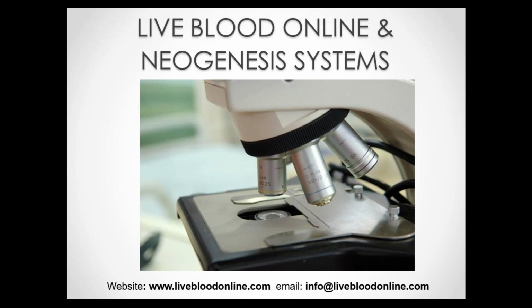Whereas in live blood analysis, because the blood is collected from the finger and placed immediately on a slide and viewed straight away under the microscope, under high magnification, and of course nothing is added to the blood, it is viewed exactly like it is in the body. So any anomalies that are seen are there because that is the condition of the blood and not because of anything that was added to the blood or how the blood was altered in any way.